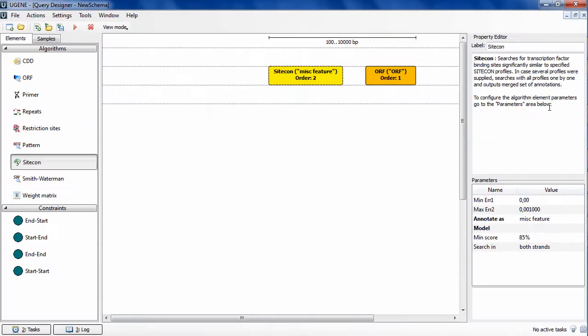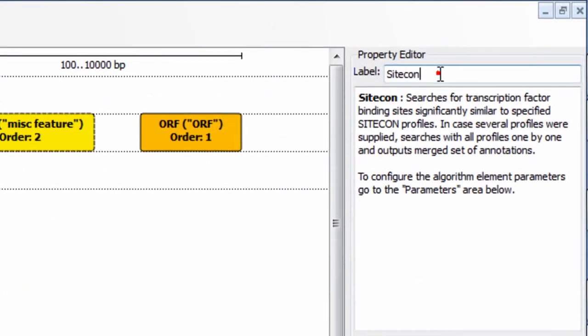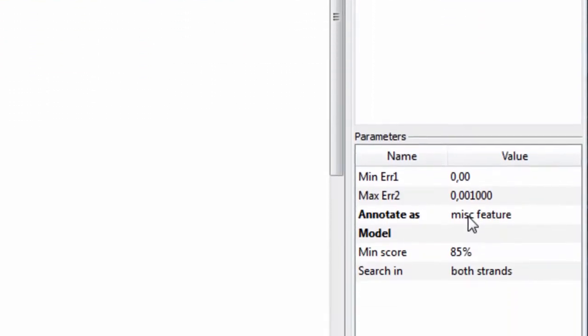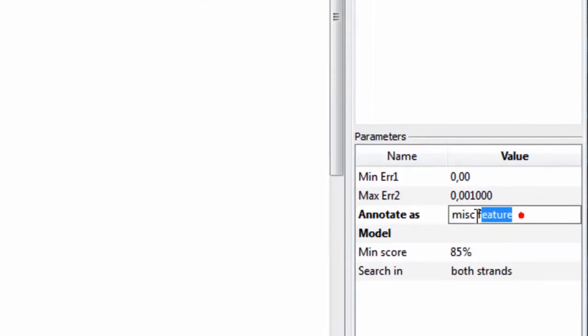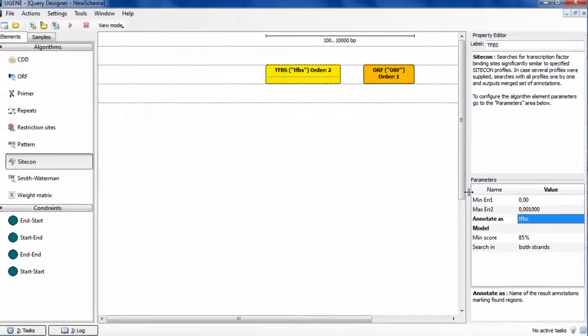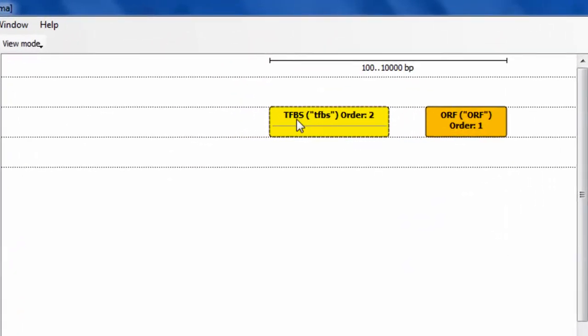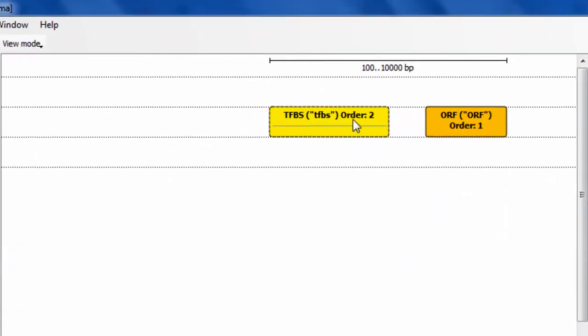You can see at this point that the Query Designer interface is very similar to the Workflow Designer. Let's set TFBS value for the sitecon element label and the annotations name parameter. These two parameters are represented at the element's title.